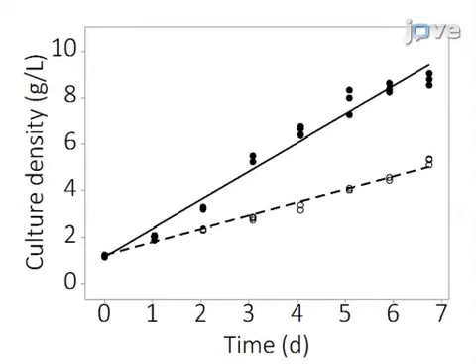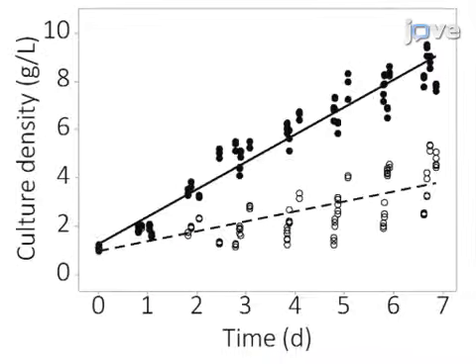This figure shows the average N. salina 7-day culture densities for control reactors and multi-metal contaminated reactors, with very small standard error based on sampling from 3 independent PBRs. To ensure this was not an isolated result, 3 more batches were grown, and the combined results for all 4 batches are illustrated here. This study shows that there is a statistically different and negative impact of inorganic contaminants on N. salina production from 2 days onwards, compared to controls.